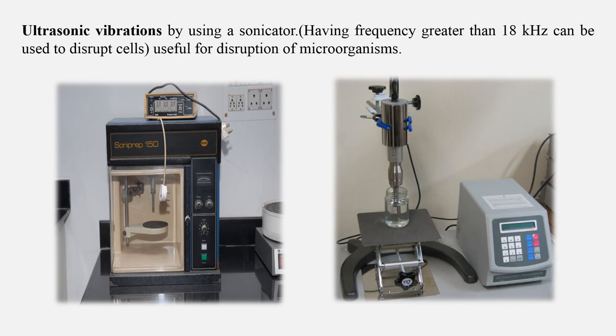One more thing in this method is that it generates heat. هنا تتكون حرارة شديدة أثناء عملية التحطيم، لذا يفضل وضع العينة في إناء يحتوي على الثلج أثناء عملية التحطيم، وتكون عملية التحطيم بفترات متقطعة، أي عملية vibration 1 minute, then wait 1 minute in ice, then return the cycle, normally used for 3 or 4 cycles.